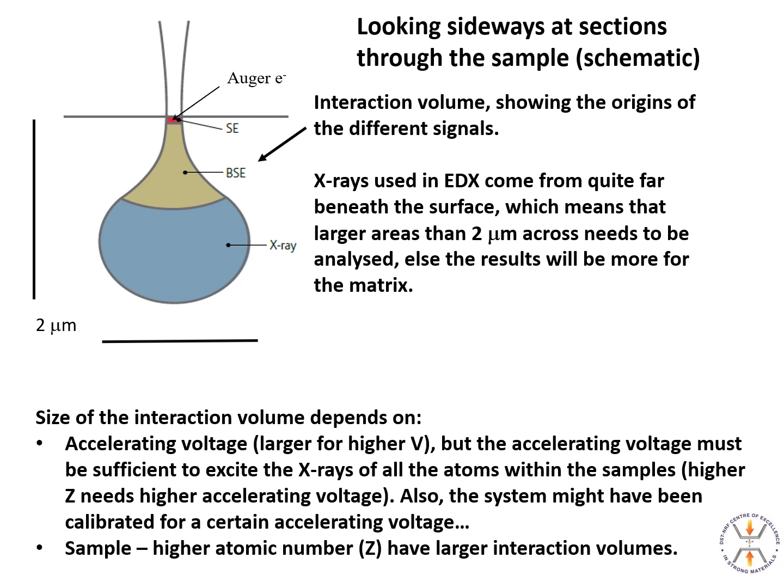Right. This is very important to try and explain why you try and analyse the largest areas you can find. If you imagine there's the beam and you're looking sideways through your specimen, that's what you see. That little bit is what you see on your surface and on the screen when you do a spot analysis. And sometimes people think, oh, if I put that spot on that area, I can analyse it. No, it doesn't work like that, because what happens is the incoming electrons interact with a volume. Secondary electrons come off first at the top, that's why it's topographical.